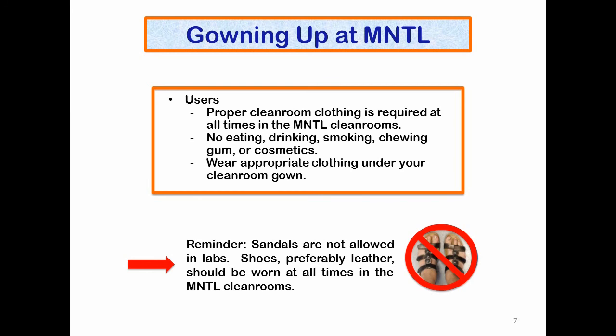Gowning up in the MNTL, users are required to wear proper cleanroom clothing in the cleanrooms at all times. This means the cleanroom suit and booties, as well as the bouffant hairnet and the blue booty coverings over your feet. There is to be no eating, drinking, smoking, chewing gum, or cosmetics in the cleanroom. This is to reduce particle emission from your bodies, which is the largest source of contamination in the cleanroom.